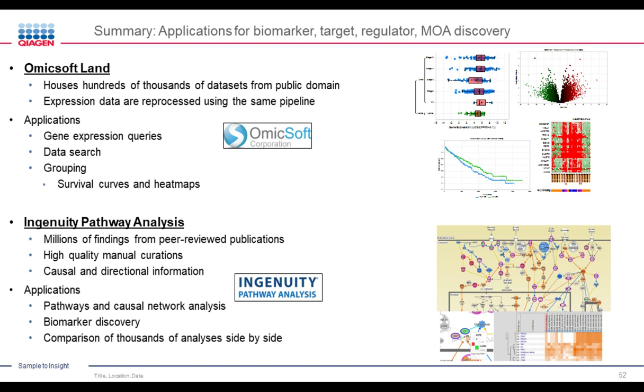So let's get started. Our first question is, can you talk about the export options for different views that you showed in your presentation? Yes, great question. So everything I have shown, right? So this is a concern that's brought up by many of the users when they actually start using our software, that they use some other software in the past and that don't allow export. So pretty much all the views I have shown, they can be exported as high resolution images.